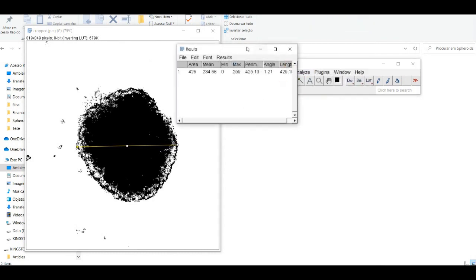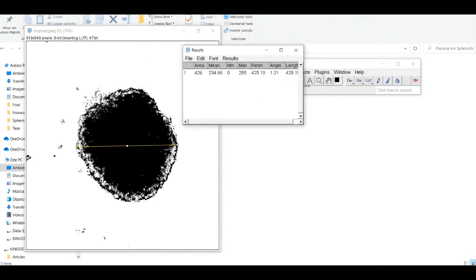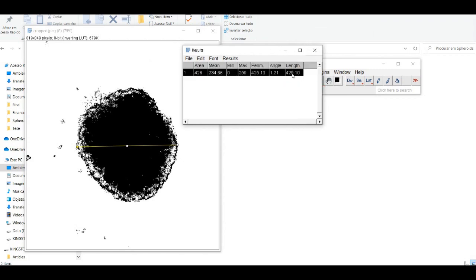You can now use the measurement tool to measure the diameter of the spheroid and obtain the result through Analyze measure.